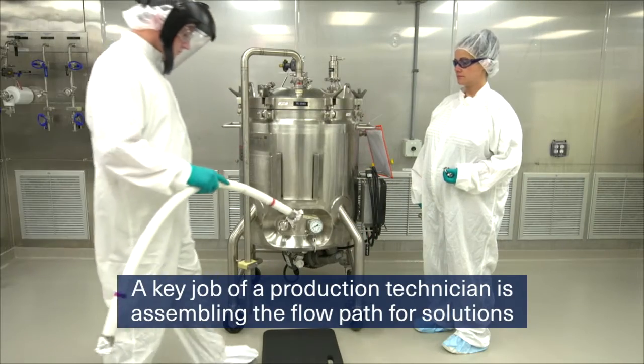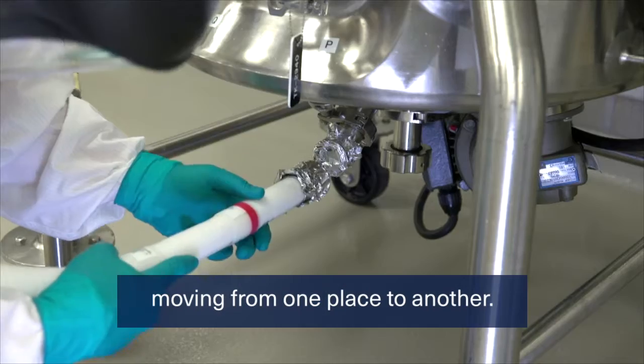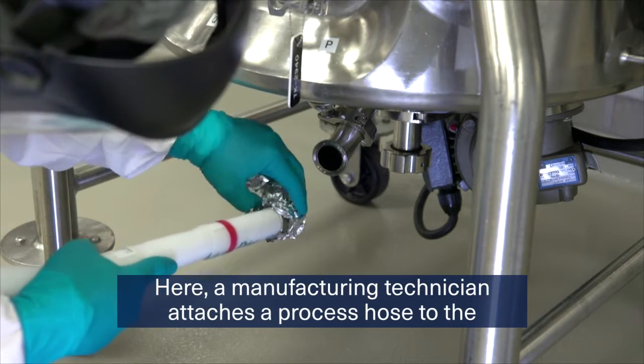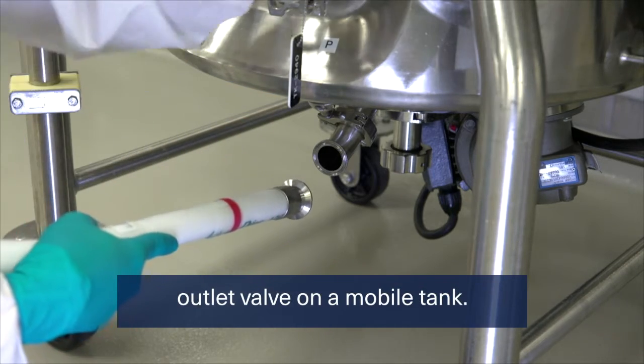A key job of a production technician is assembling the flow path for solutions moving from one place to another. Here a manufacturing technician attaches a process hose to the outlet valve on a mobile tank.